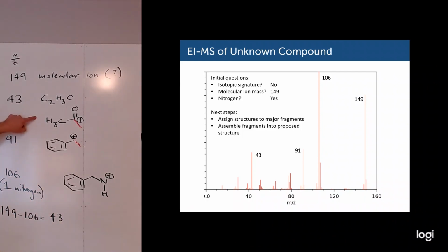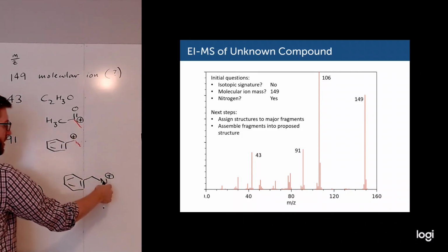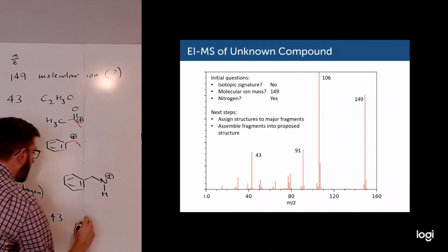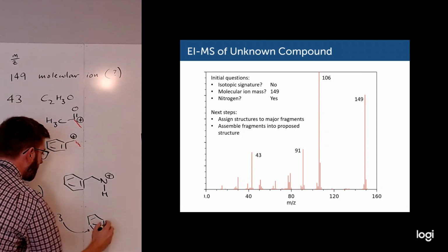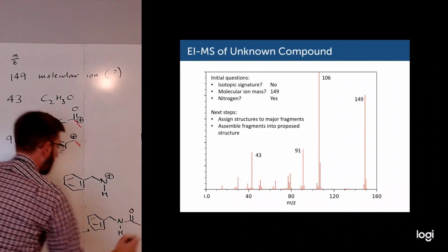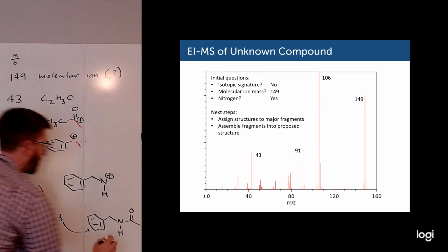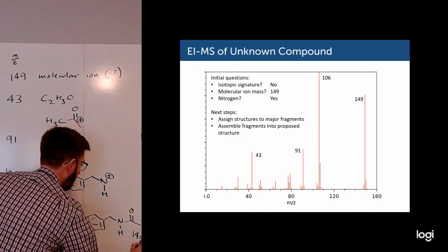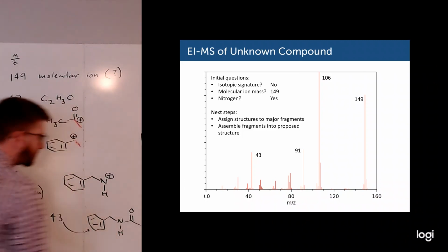So this is the piece. So that tells me that the thing that's connected to this carbon must be this nitrogen. And if I now draw this structure that I can imply here, I actually hit the M/Z ratio that I want. 149 molecular weight. It looks like that might be cut off a little bit, so I'll rewrite it.